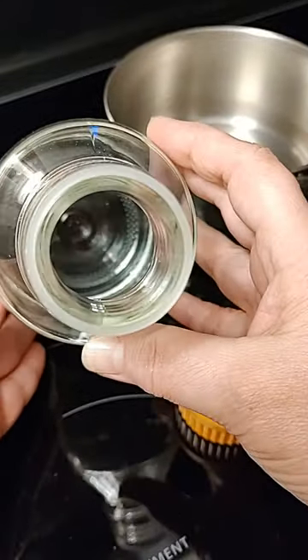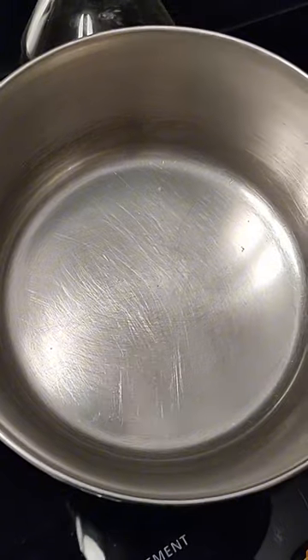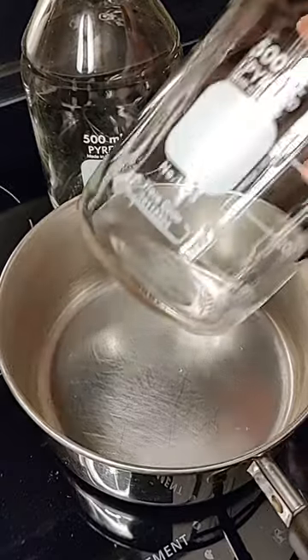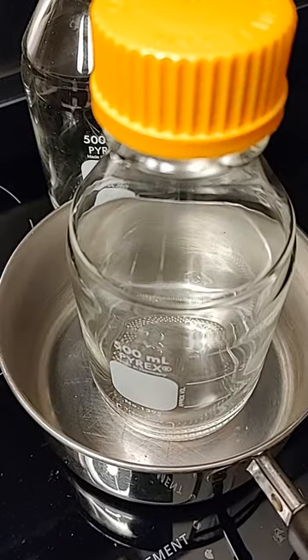And if you don't want to invest in the jar, you can simply use a saucepan. No heated stir plate needed. And you don't even need to heat your saucepan. You're going to use boiling hot water with your agar.